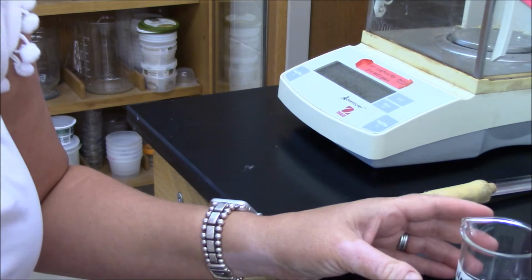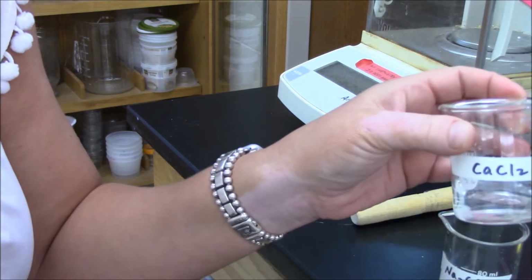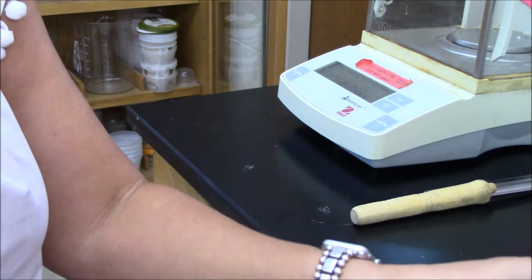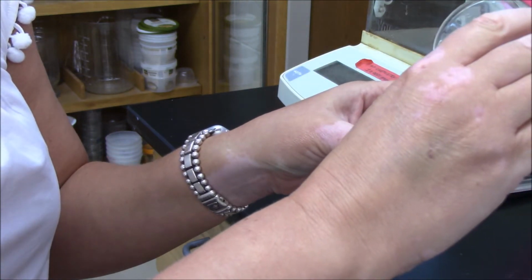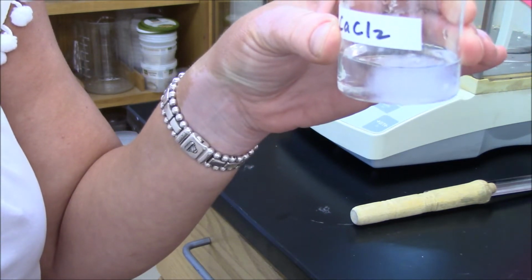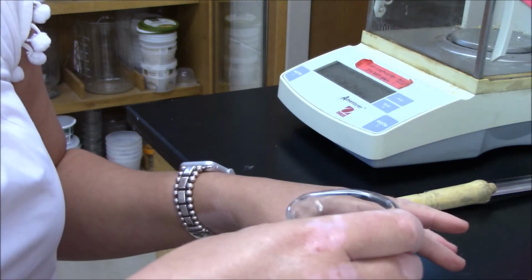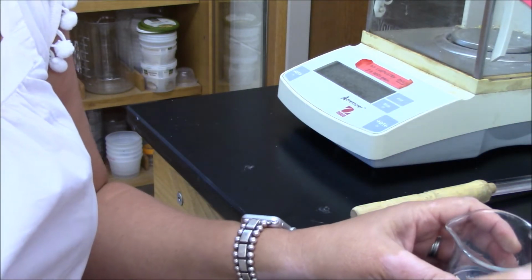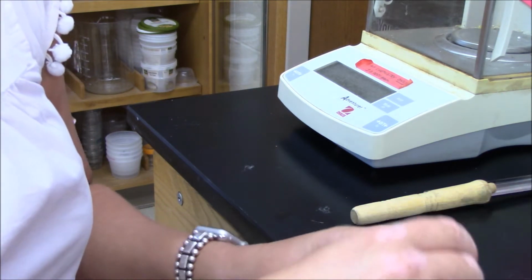In the next step, I'm going to pour a small amount of the sodium carbonate solution into the calcium chloride solution. There it is. Stir and observe. Okay. What you can see is a white precipitate forms. I'll stir, and I'll continue to do this until all of the sodium carbonate has been added to the calcium chloride.